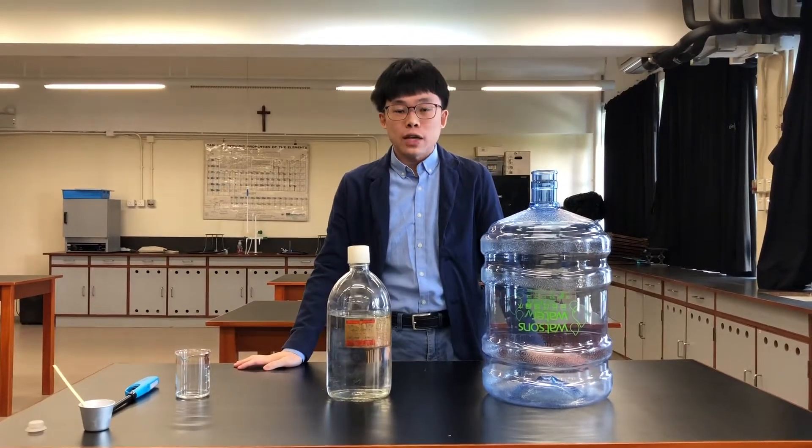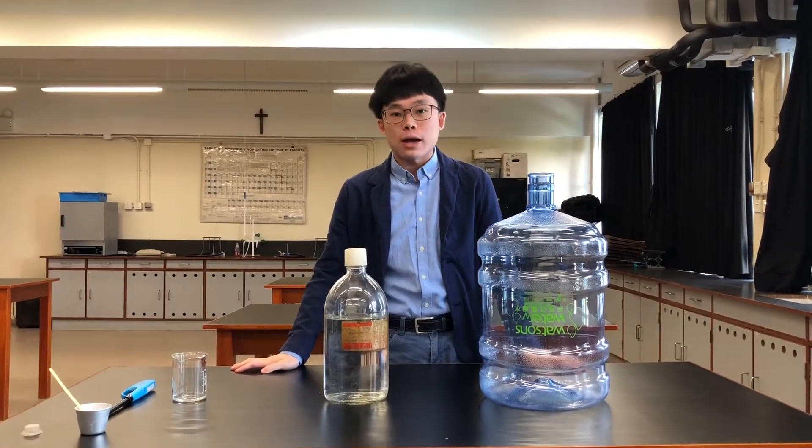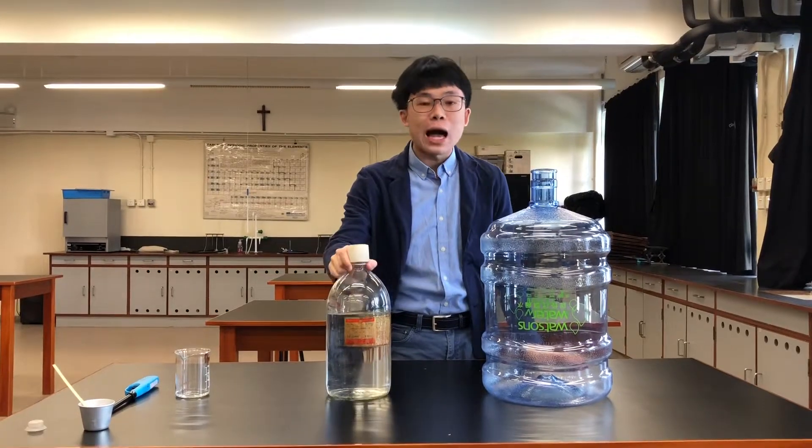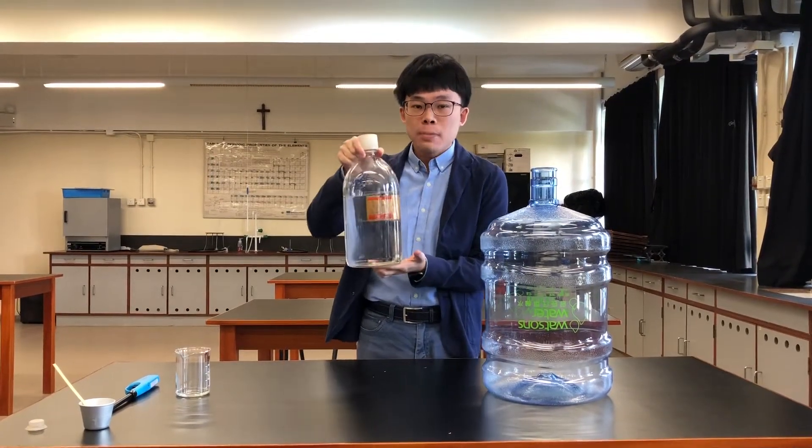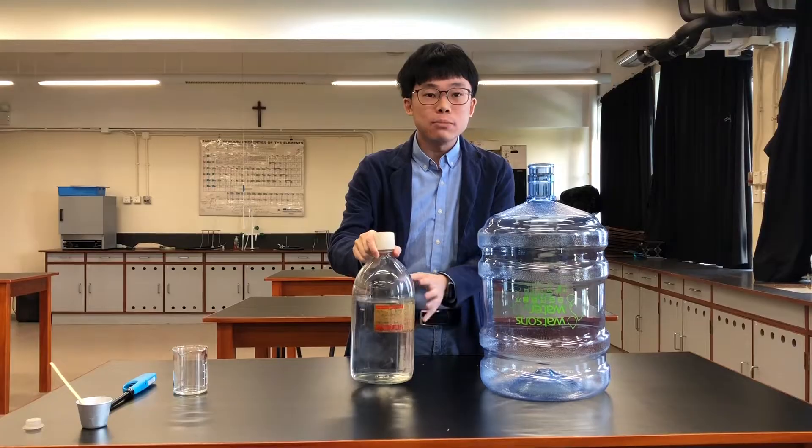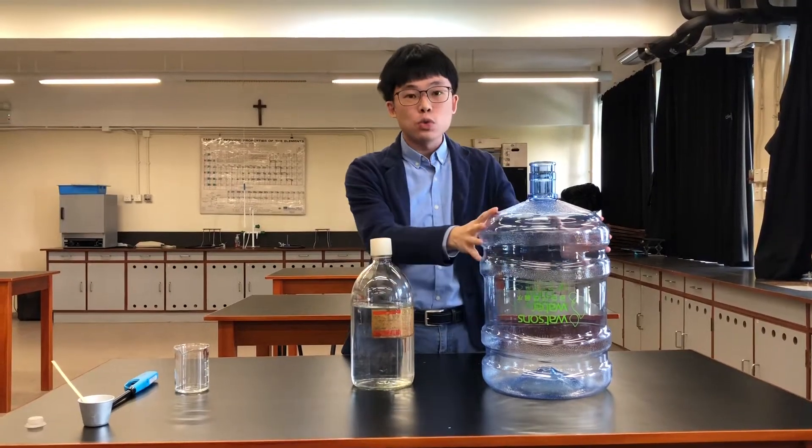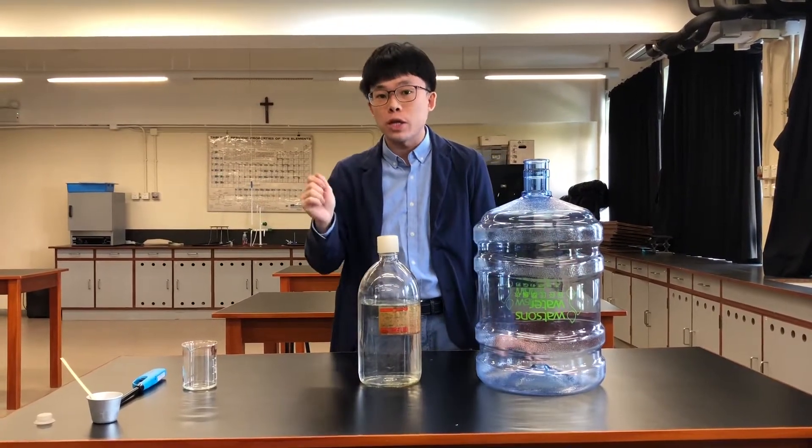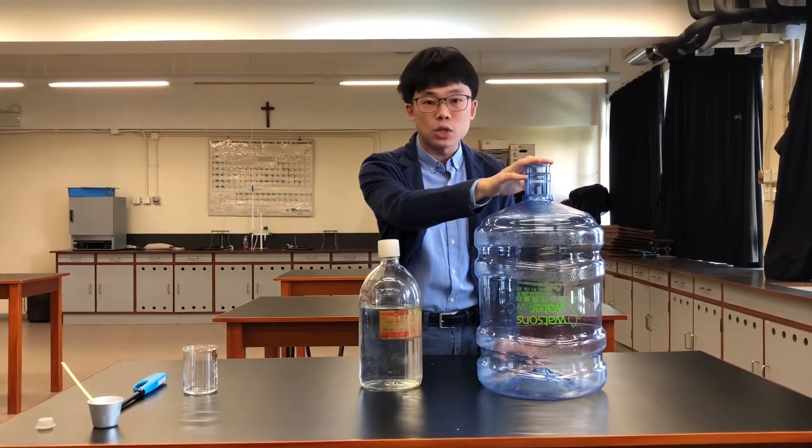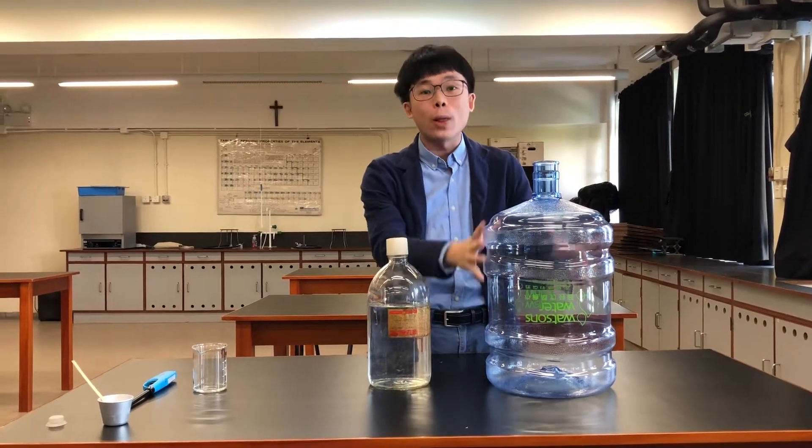Today we are going to demonstrate an experiment on the combustion of alcohol. Right now I have isopropyl alcohol with me, and we are going to pour some of the alcohol inside this huge water bottle. Then we are going to bring a burning splint over the mouth of the water bottle and see what happens.